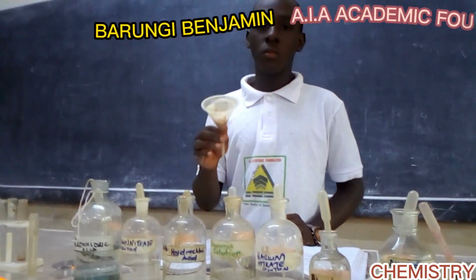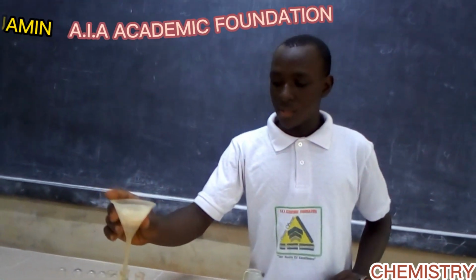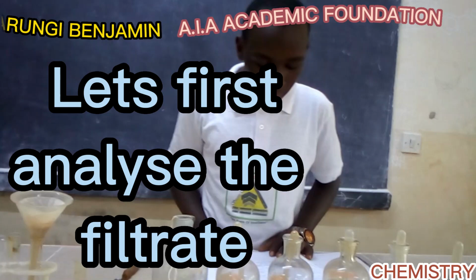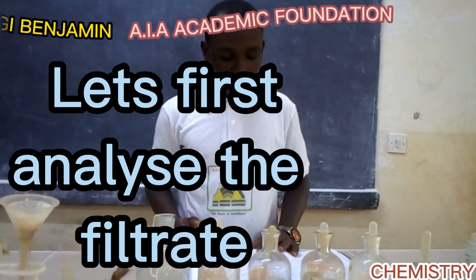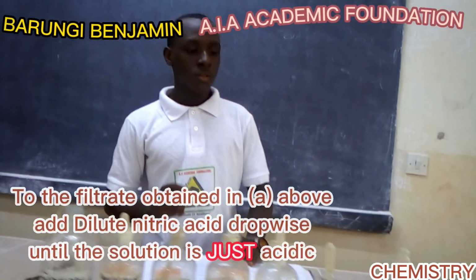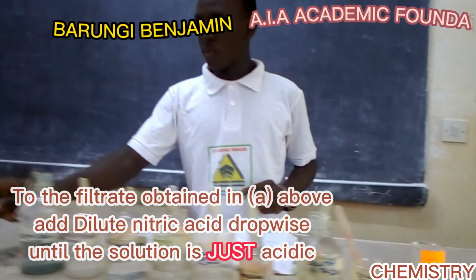So we shall also include iron 3 ions in our deductions as suspected present, because we don't know what exactly is in the solid that we are provided with. Now they have said to the filtrate obtained in A above, add dilute nitric acid drop by drop until the solution is just acidic. So this is our dilute nitric acid. We are going to add drop by drop.